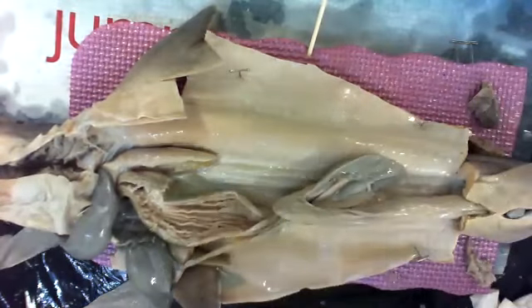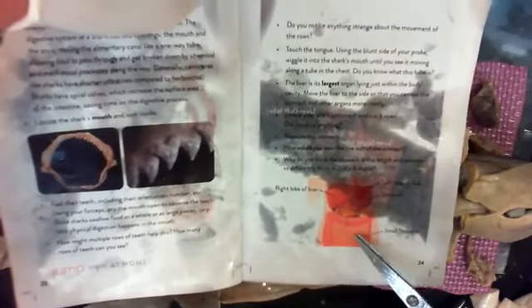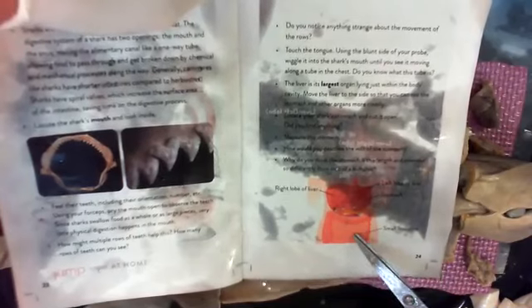You have a small intestine and a large intestine. So yours, there's a stomach, it dumps down into the small intestine that weaves all over the place. And then it comes down, goes into the large intestine, and out the body. Small intestine absorbs nutrients. So you dump that bile on your food to break it down. You dump chemical enzymes to break it down. Once it's broken down, you get all those good nutrients, the sugars, the proteins, and the fats out of it. What's left is feces. Feces goes into the large intestines, and that sucks water out because we're land animals.